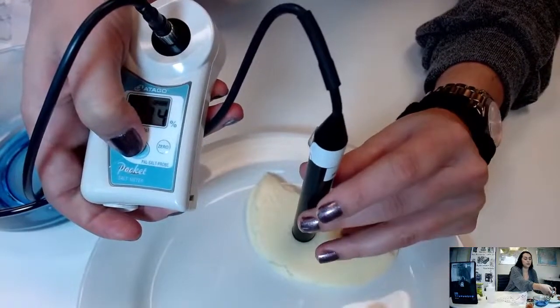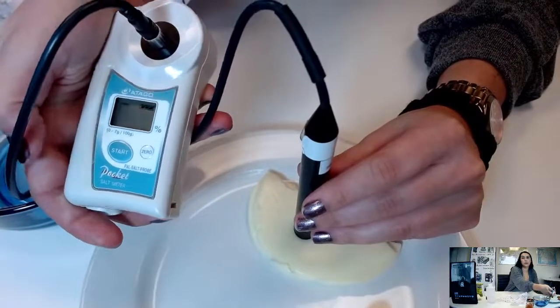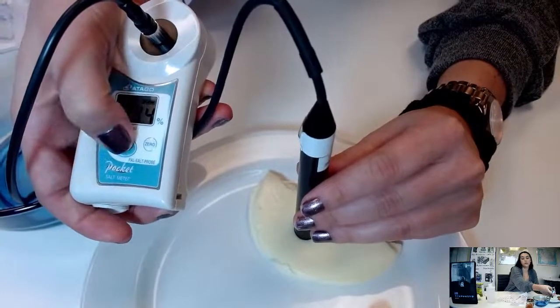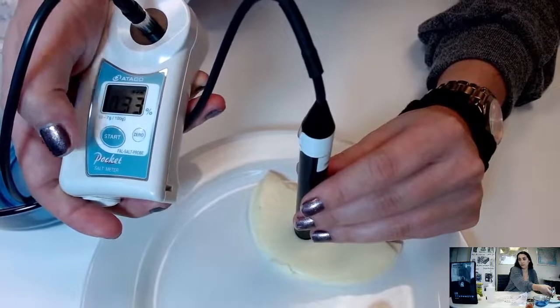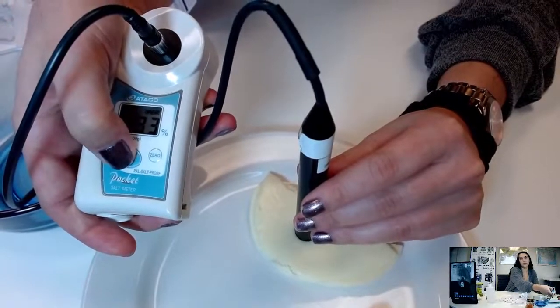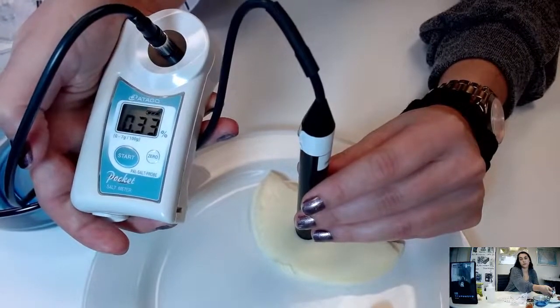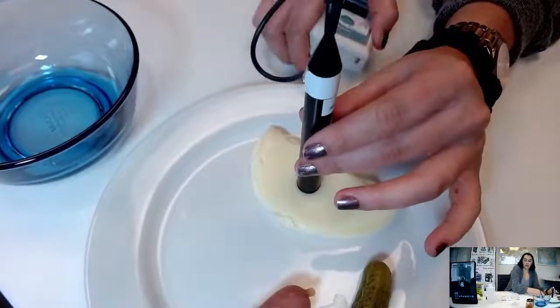And this cheese was also a little cold because it was in the fridge. So we'll compress one more time and see if we'll get the same. 0.34, compress one more time. 0.33, so it's acclimating a little bit because of the temperature. 0.33, okay, perfect. All right.